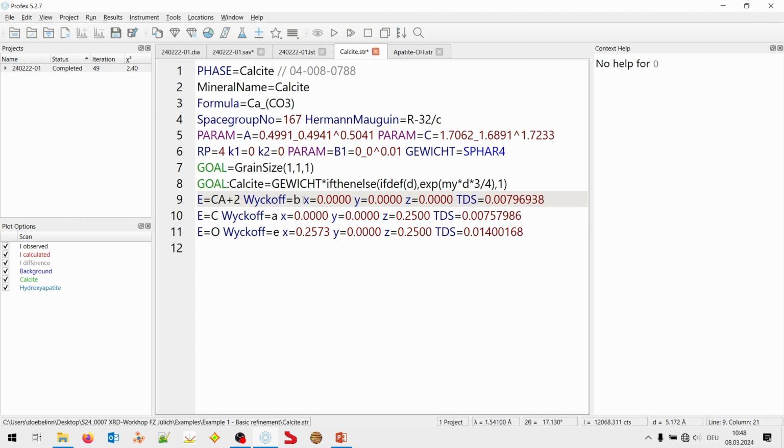One thing I noticed here, there's actually a bug in this file. It does something we should not do. It mixes an ionic scattering factor with atomic neutral ones. This is illegal, but the software will not complain. What it means is that we actually don't have enough electrons in this structure, because these are neutral ones and this one is positively charged.